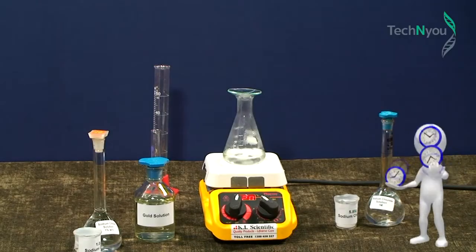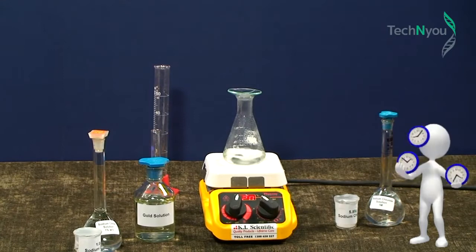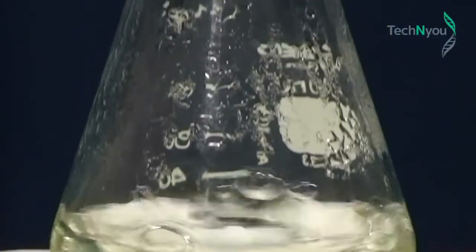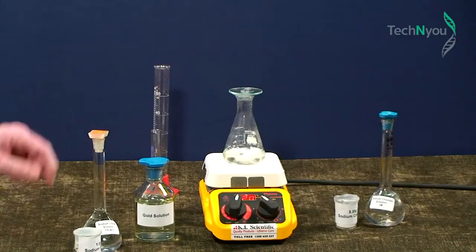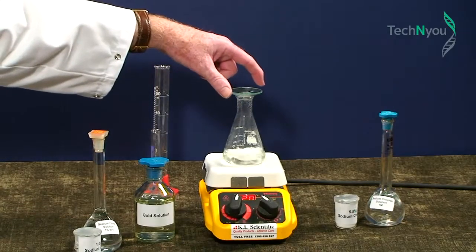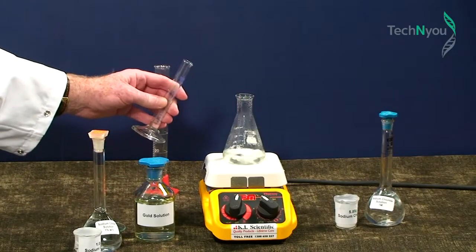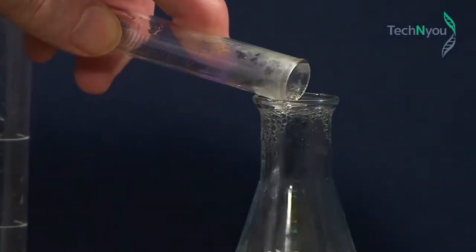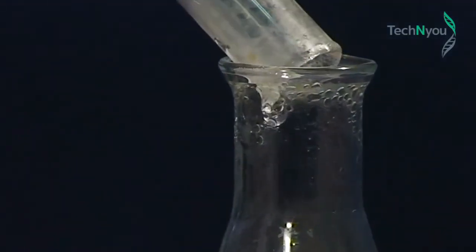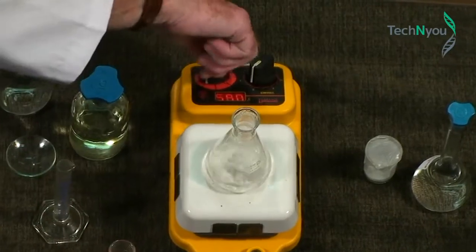Once it boils, we'll remove the watch glass and add the citrate solution. Okay, it's boiling. Leave the stirrer on and add 2 ml of sodium citrate, which facilitates a chemical reaction and produces uniformly sized particles. Now we turn off the heat.